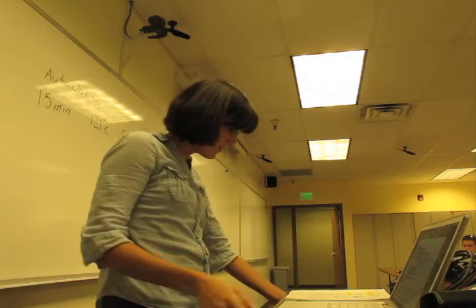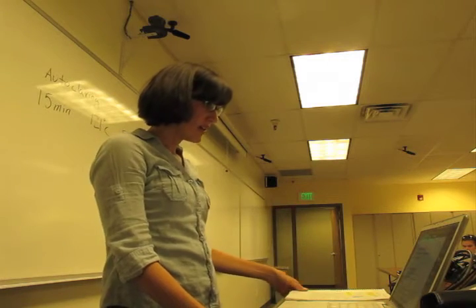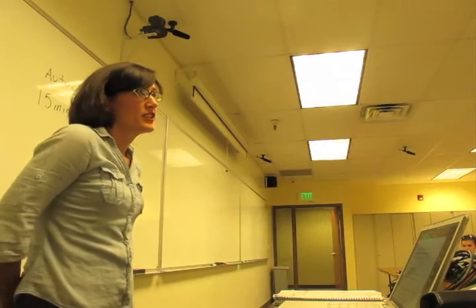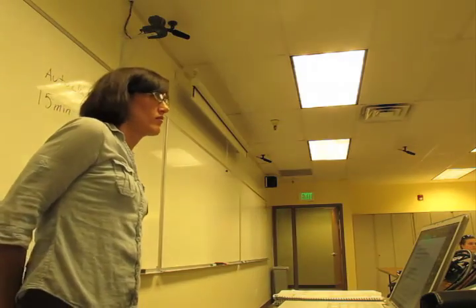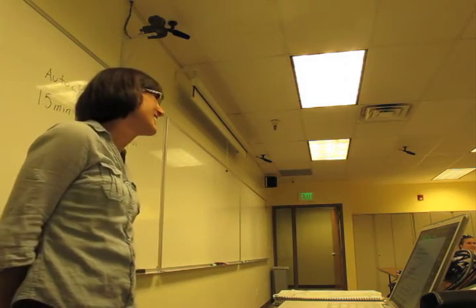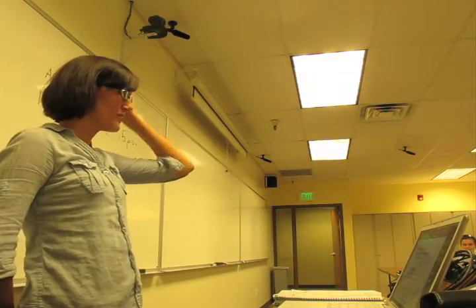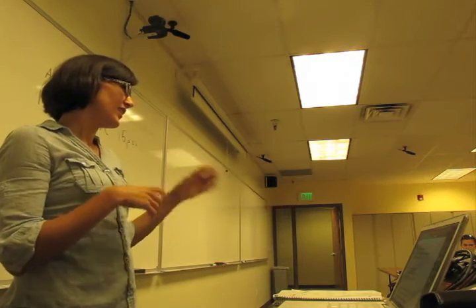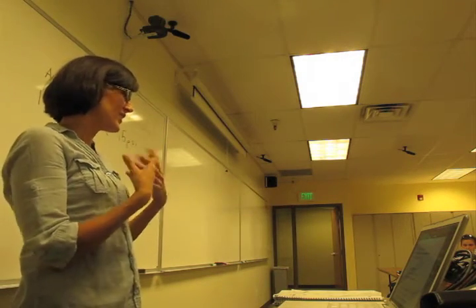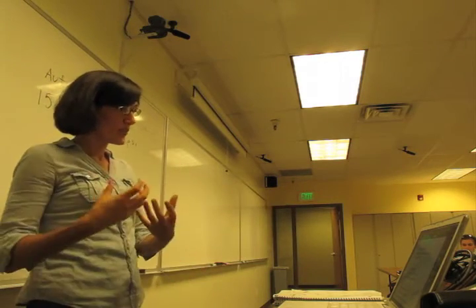And then in lab 5, this is where we did the simple stain. You guys should know the difference between a simple and a differential stain. Can anybody tell me the difference? Come on, you guys know this. Simple is just staining it one color, just one stain. And the differential stain is like the gram stain or the acid-fast, where you use 2 different stains. Different bacteria will retain a certain stain. Some will retain the primary stain and some will retain the counterstain.